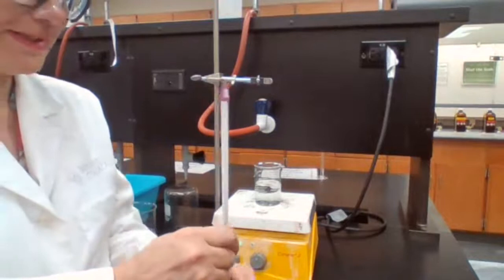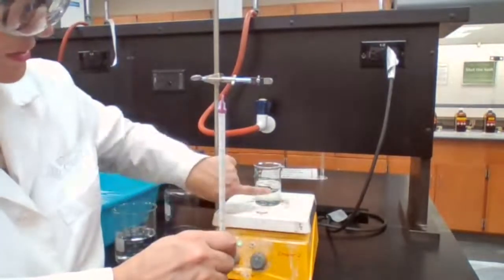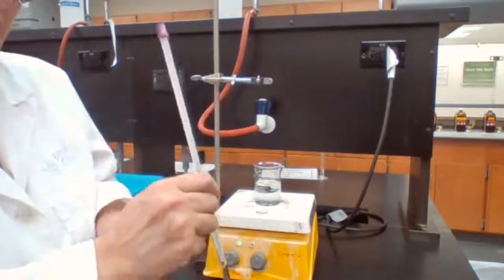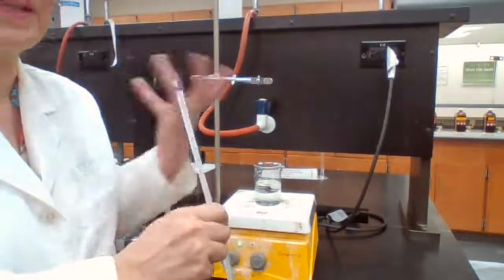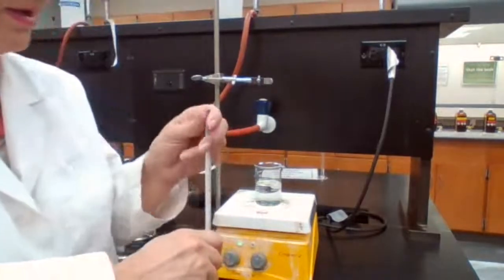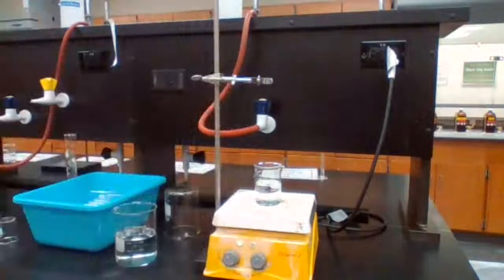So let me bring the sample and place it in here before it gets too hot, because I don't want the temperature of the solution to be higher than the boiling point of the sample. As soon as I place it, it starts boiling and I don't get data. So I better move fast to get the sample.